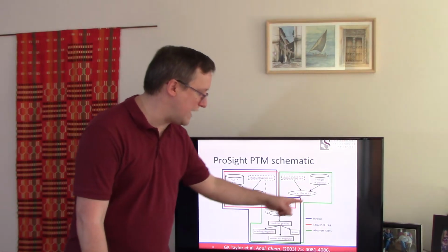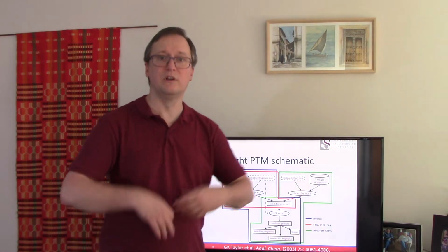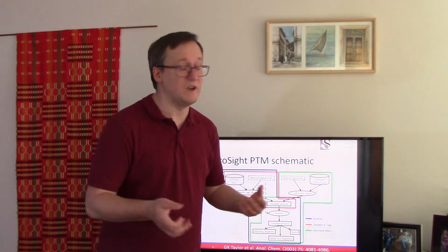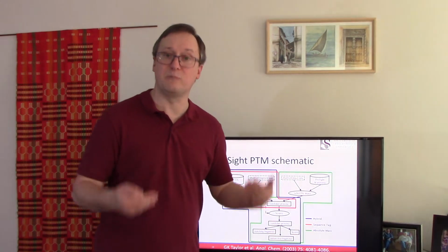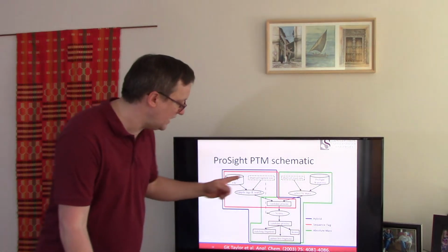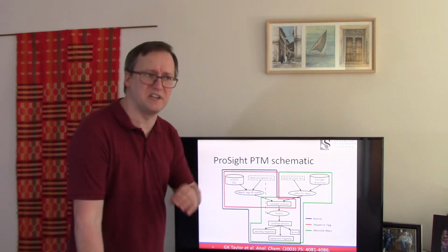So that's one route, the absolute mass route for interpreting this tandem mass spectrum and matching it to a proteoform on the basis of what is very similar to the precursor mass filter in database search. So green gets us there. You could think about this from the opposite end, though.